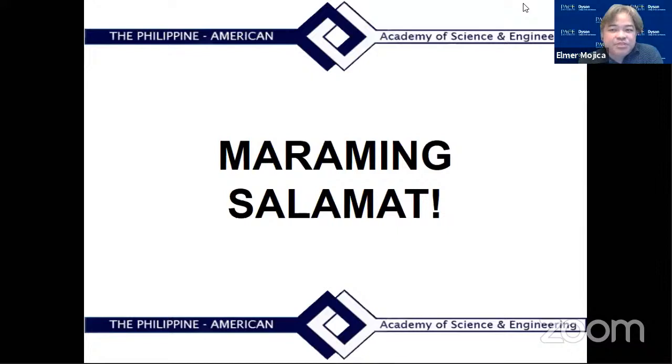Okay, and for the shift, it's one wave number for the signal to noise. There's really a story there, because usually we have some problem with the structure. The building is near the LIRR train, so I made it my SOP that every time we run the instrument, we run toluene, and we always record where the peak of the toluene is. Because I remember, after three years, I said, oh, there's a shift. And when I realized that the toluene also shifted, I just told the student, oh, don't mind, I just need to do it again, because this is a false alarm.